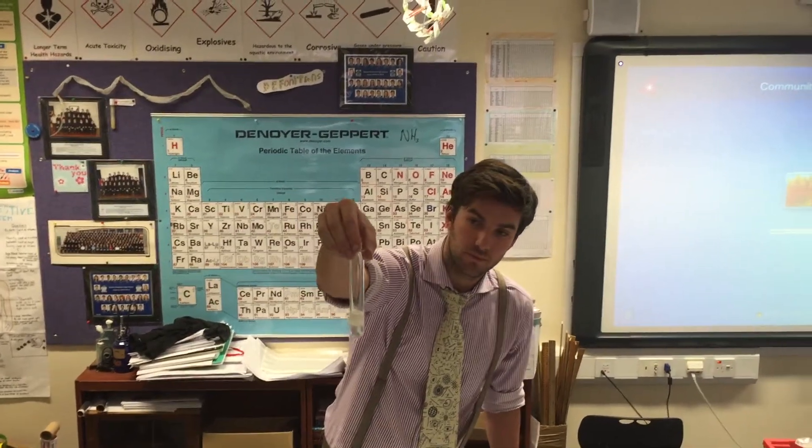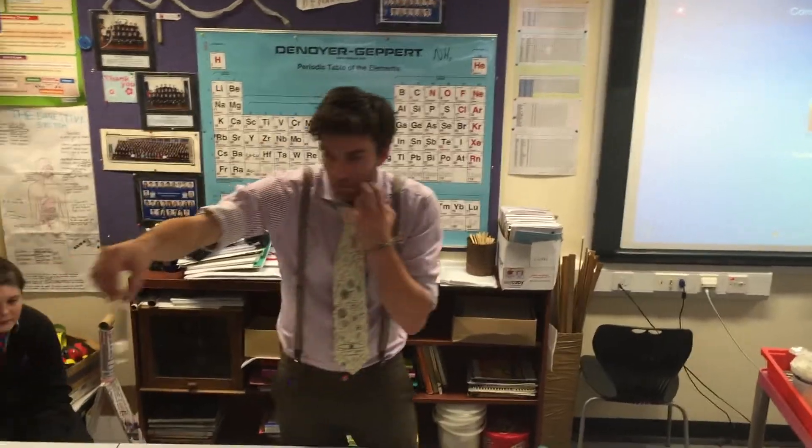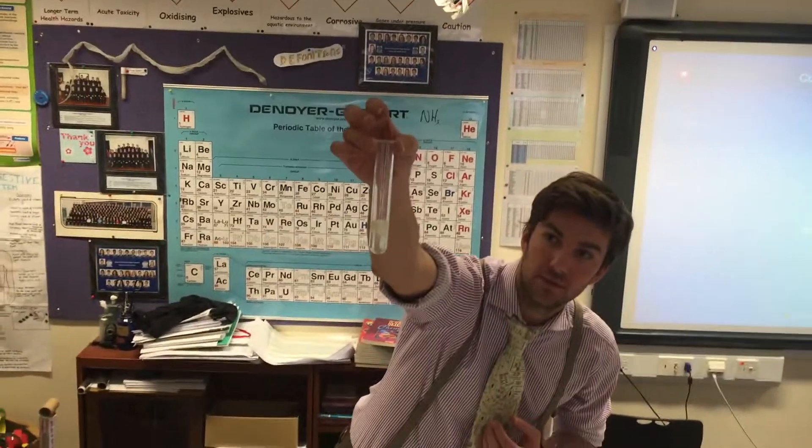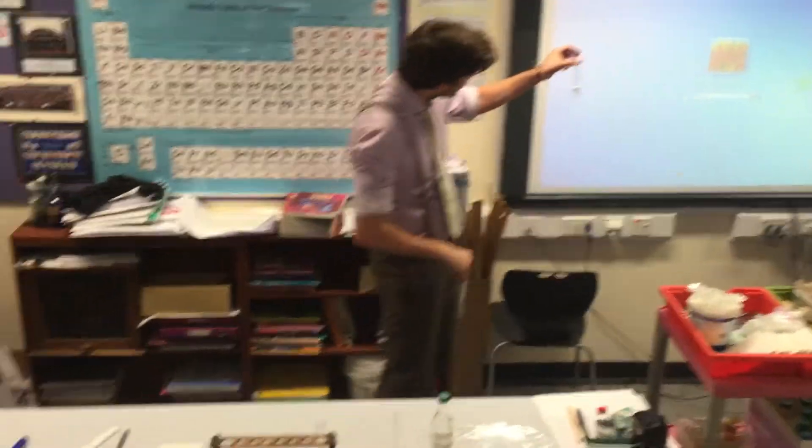What can you see happening? Steaming up. What can you see on top of this water? Bubbles. It's a lather, isn't it? There's a lather. Can you see that? It's still growing. Look at that. Can you see the white?